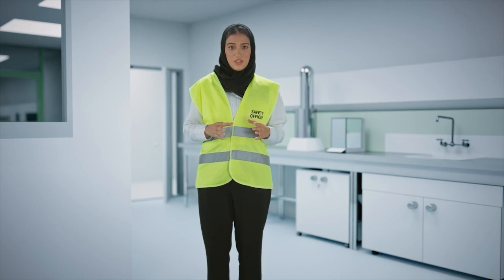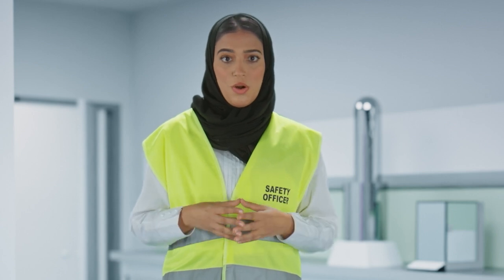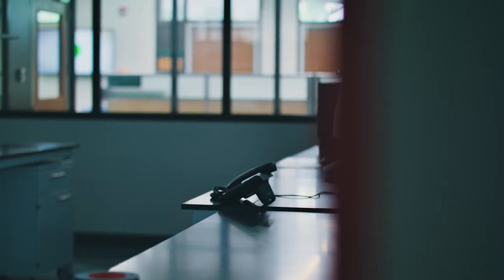Generally, the emergency procedure that you may need to follow will depend on the type of immediate danger and injury sustained, but may include elements of the following steps. Determine whether you and others need to leave the area immediately or whether there is something you can safely consider to minimize injury and damage.